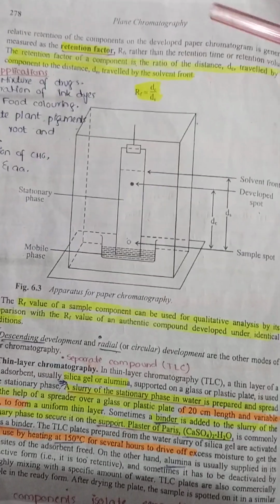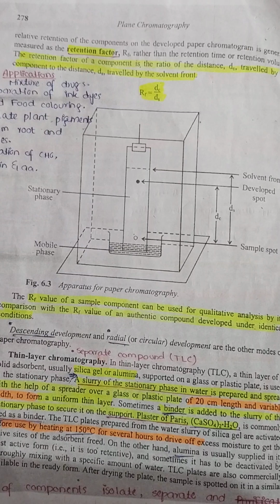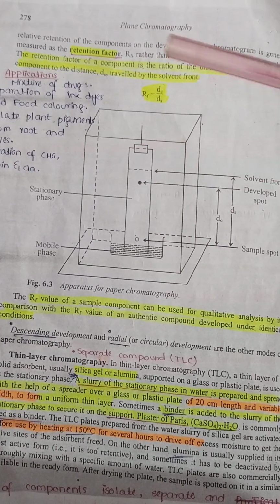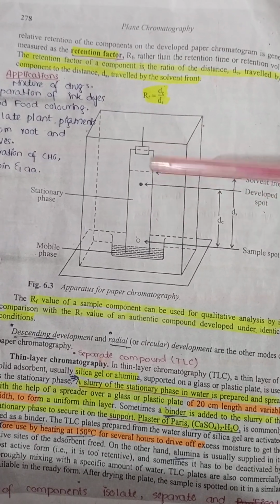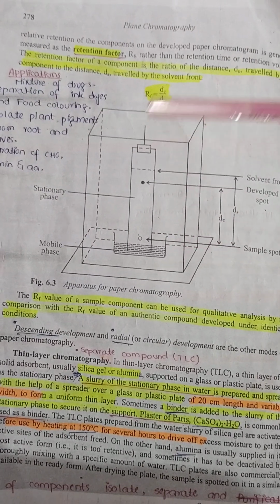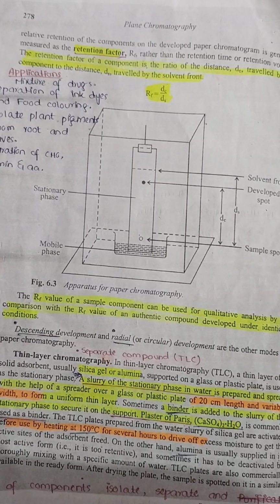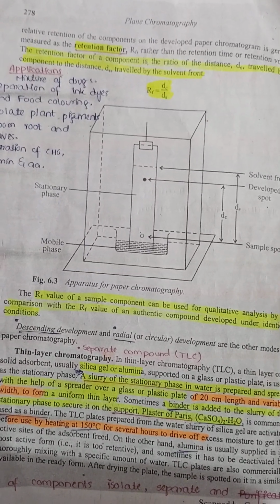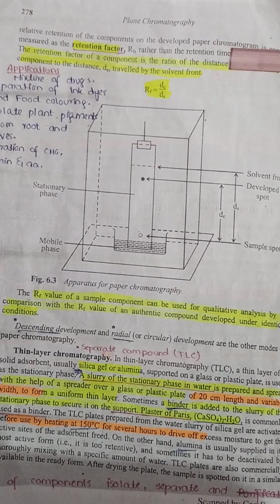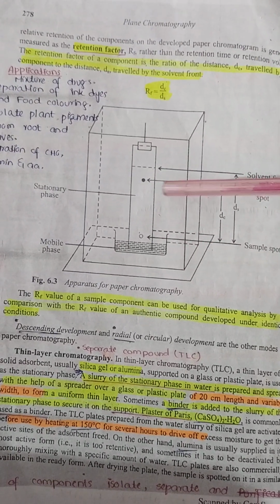Imagine that this is a paper, and we take a concentrated spot on the paper at the edge on one side. After that, we place our paper in a chromatographic jar. In the chromatographic jar, our mobile phase is placed, but we take care that our spot of the mixture does not dip in the mobile phase, that is, it stays above the mobile phase.